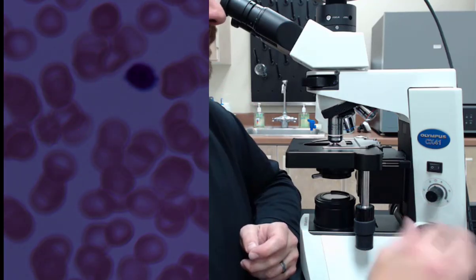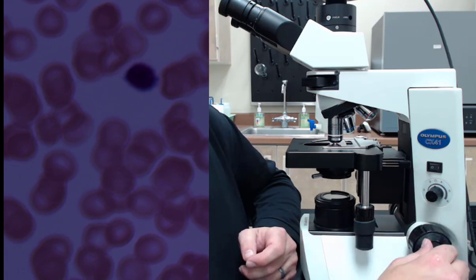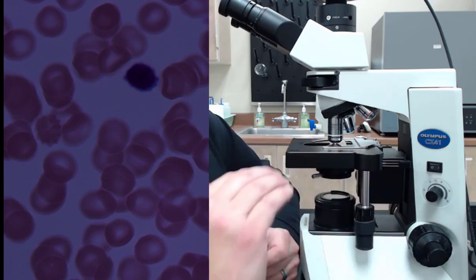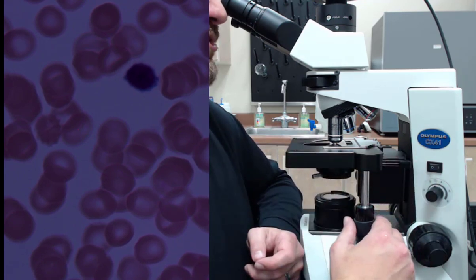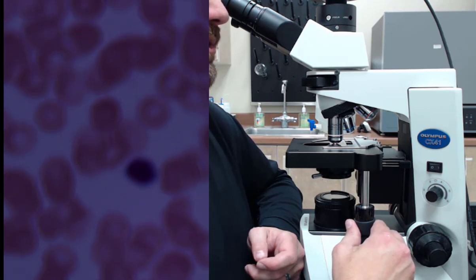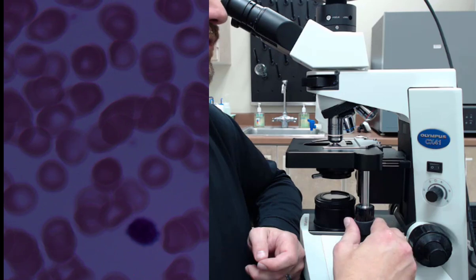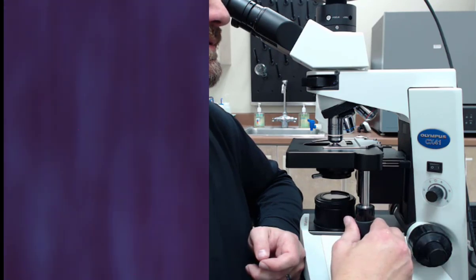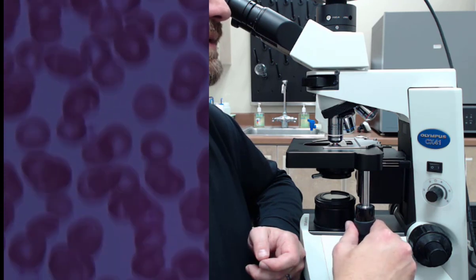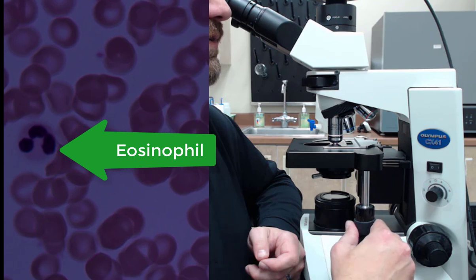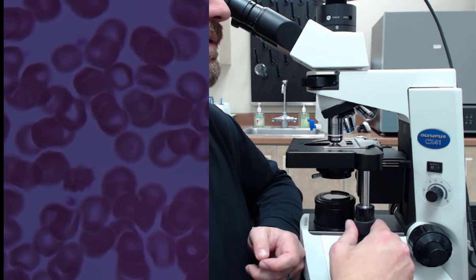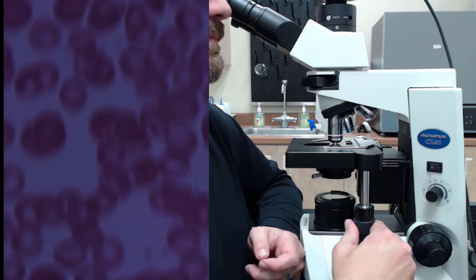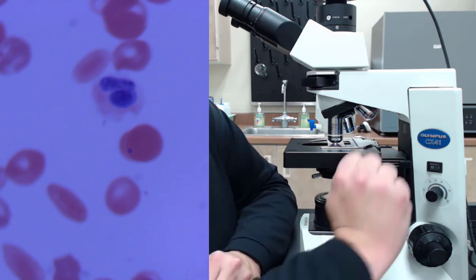And now I just jumped up from 400 times magnification to a thousand. But notice how that it's almost perfectly in focus. And the key there is I did my work moving forward like I talked about in other videos. And I made sure it was as focused as it could be at the high dry power. And that made my life a whole lot easier as I moved forward. So I'm just going to tweak this a little bit. I'm just going to scan around, try to find a couple of things more interesting. Mainly we're just seeing these red blood cells here. Here's a handful of white blood cells. There's a platelet there. I'll highlight that in the video.